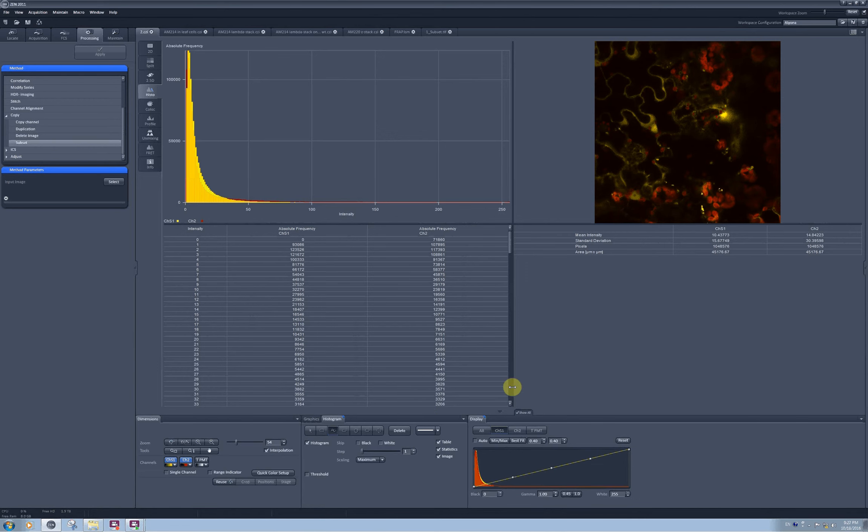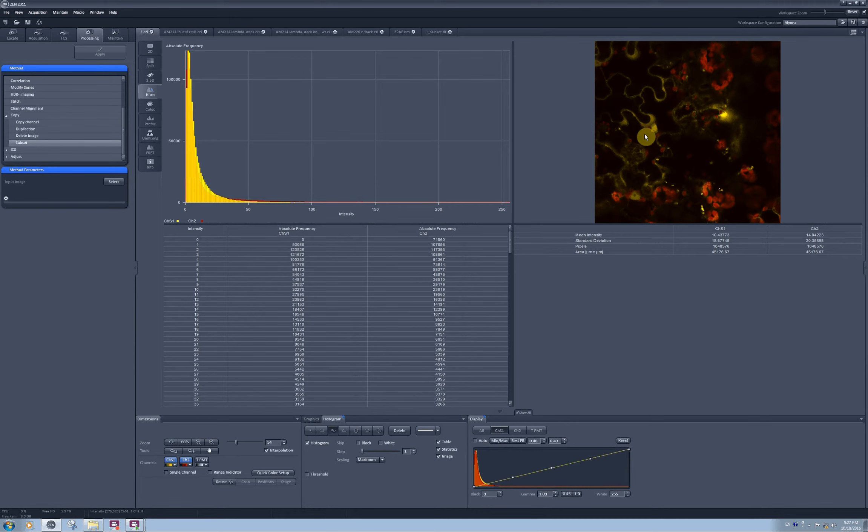Quite rarely you would like to actually quantify the whole image. Let's say I would like to know what is the intensity of the yellow fluorescent protein in the nuclei in the cells, and for this I need to select the nuclei.